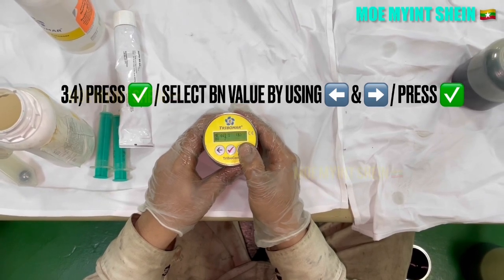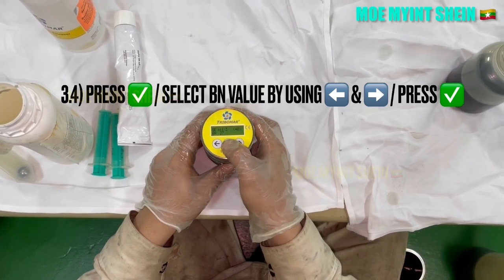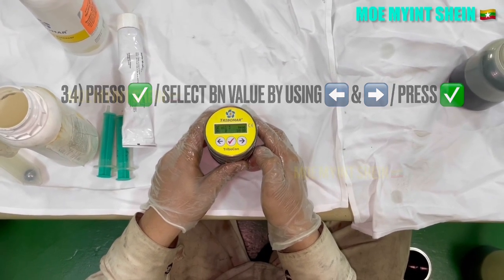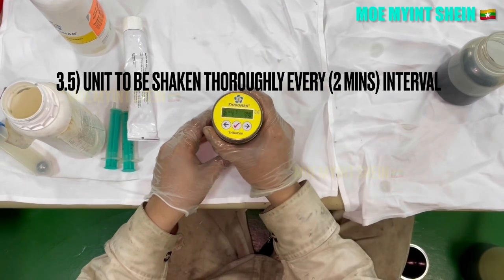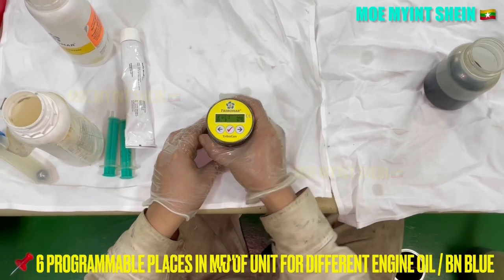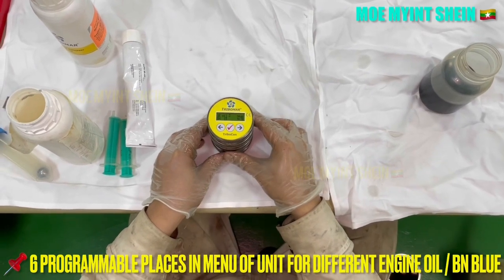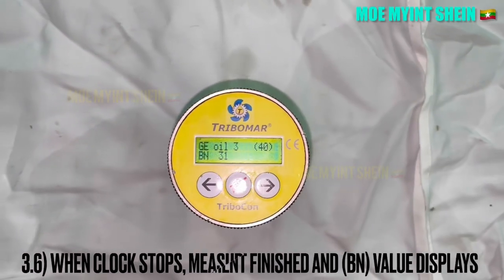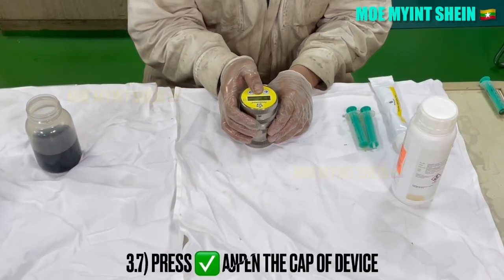Press the right marked button to start the test. Close the cup of the device. The unit needs to shake every 2 minutes. This unit has 6 programmable places for different engine oil and BN values. The BN value will display on screen after the countdown stops.